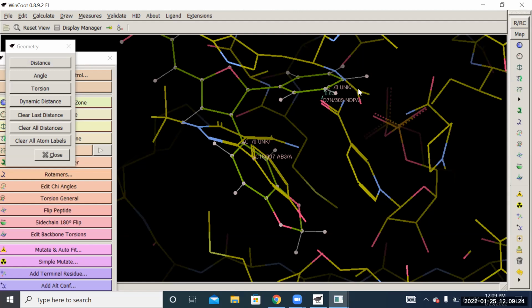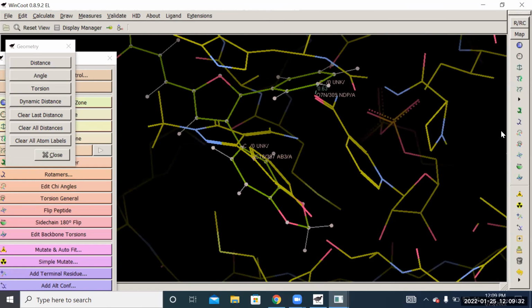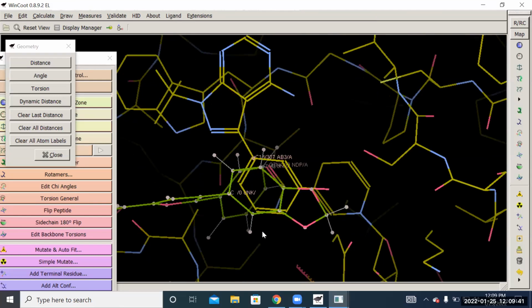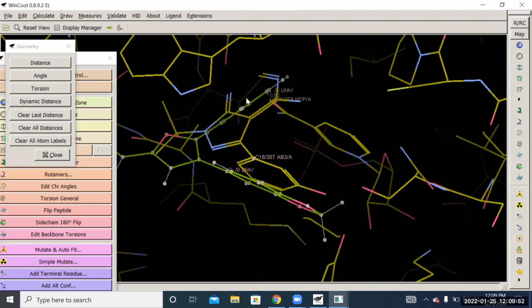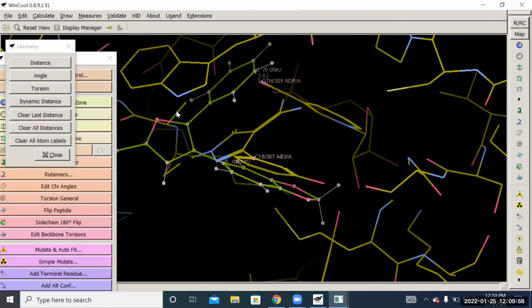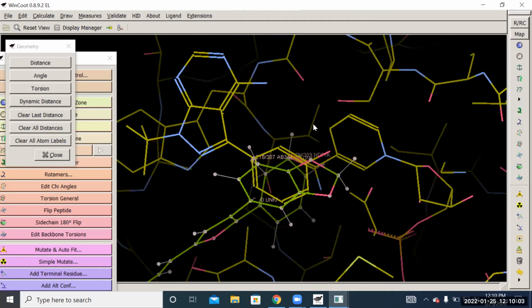And so what I usually tell students is find every place that's within 3 angstroms and find out how close they are. They should never be closer than 2.5 angstroms from any of the amino acids. Now, the one to not worry about is AB3, because AB3 is just a template. When we do the final touches on the modeling, we will remove AB3 and keep just this guy. So you can ignore all of the AB3 atoms. You don't have to worry about those being too close to here, because remember, you're trying to overlay.